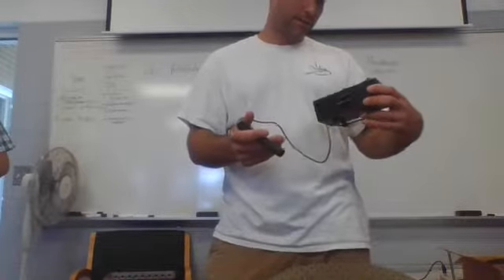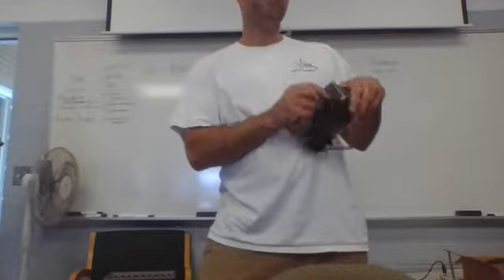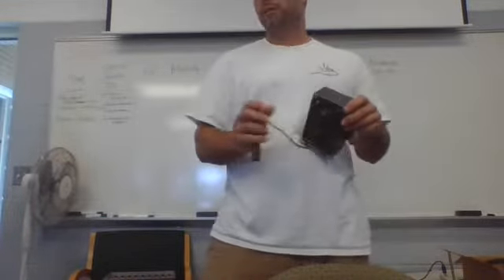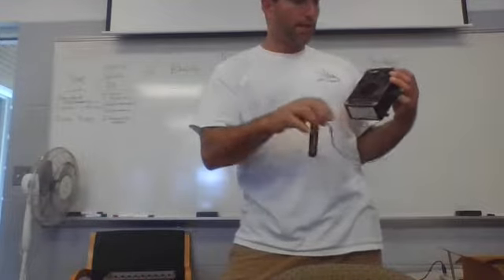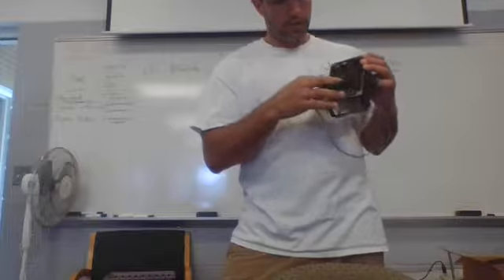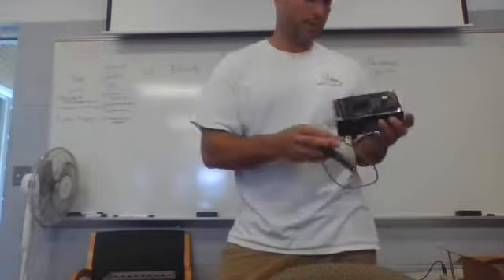I have never tried it. So you have to do the calculation then? Well, okay. Let's see. You tell it the temperature. A lot of these are temperature compensated. The fancy new meters are temperature compensated, but there you had to take your thermometer, measure the temperature, and dial this to the temperature, and then put the meter in, and it would tell you the conductance in micromhos. So that's old school.